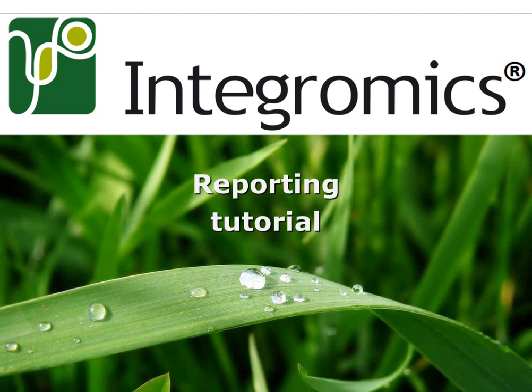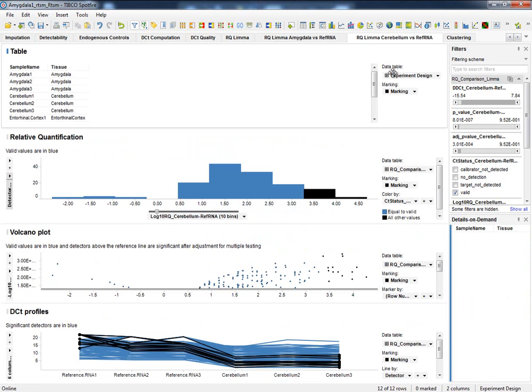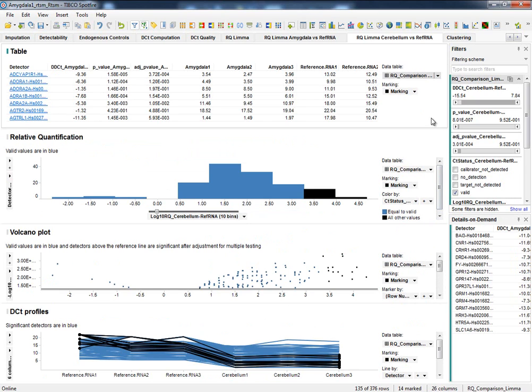This tutorial focuses on creating reports that summarize specific results from your analysis that you might want to highlight, publish, or share. This report basically consists of a set of data tables representing any type of data coming from the analysis and of visualizations that helps to summarize and understand this data. These reports can be exported to well-known formats, making it easy to share between co-workers.